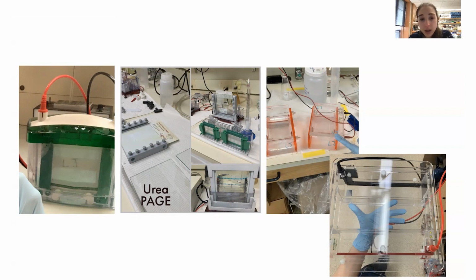If you have smaller molecules, you can use a urea page gel. And so this is what I use most of the time with my RNA, because I'm dealing with small RNA. So the ones I work with are about 20 nucleotides long. And so the urea page, it has a tighter mesh, and so it's going to separate the smaller things better. And again, it's in a format kind of like an SDS page, except we often do it in a bigger size, and we can do it in an even bigger size than these ones as well.